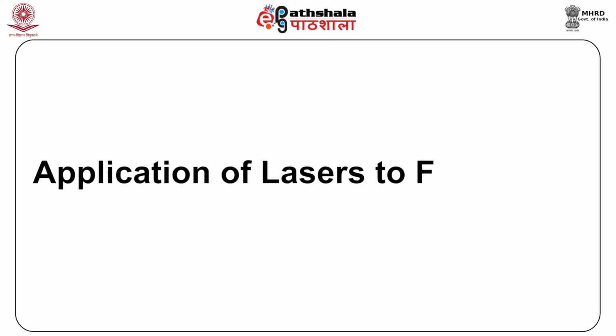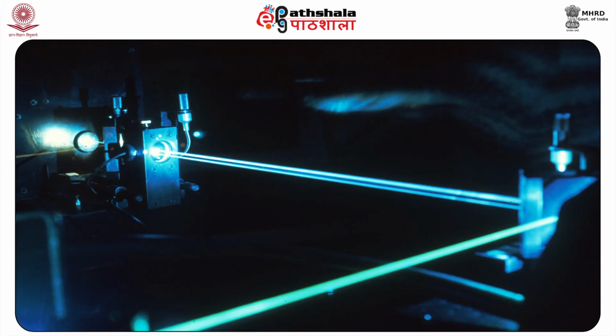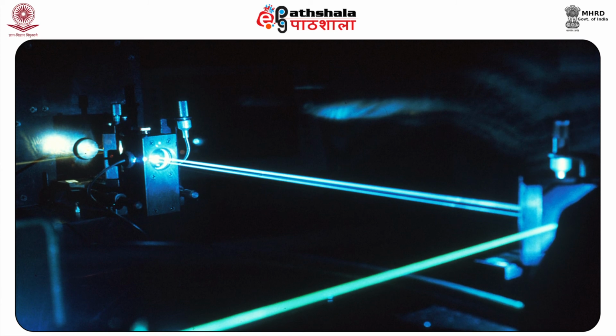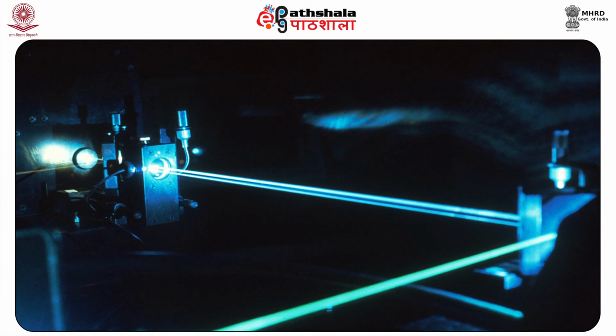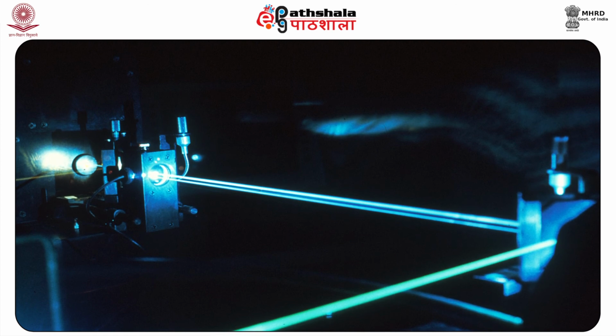Let us now have a look at the application of lasers to fingerprint detection. The most common device used for the detection of latent fingerprints on difficult surfaces is the argon laser. The surface impinged with the finger mark is illuminated with a blue-green beam from the argon laser.